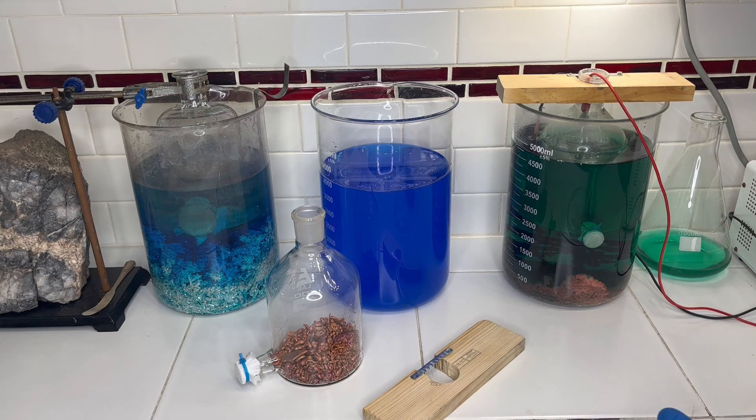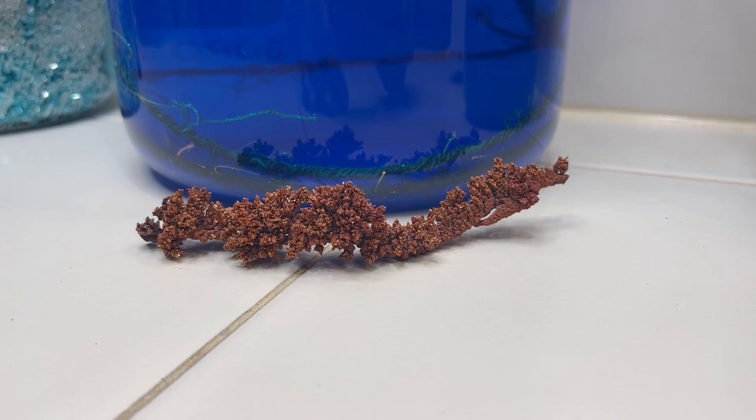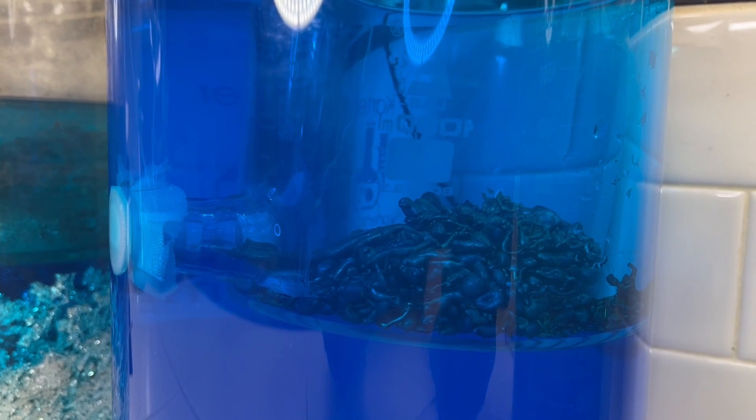We then get 99.9% pure copper plated out on the copper cathode that can be melted and either sold as pure copper or reused in the lab as a reagent. The remaining silver is captured in the anode bottle.